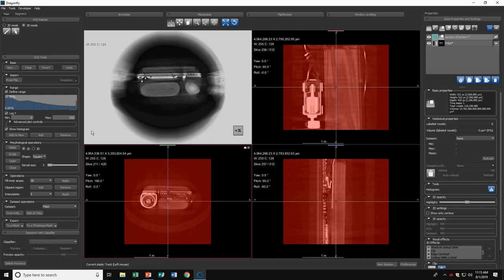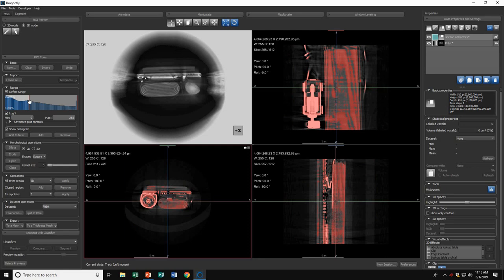a greater density, I want to move this way. Now I can focus just on the battery. You want to move your range to whatever suits your needs.